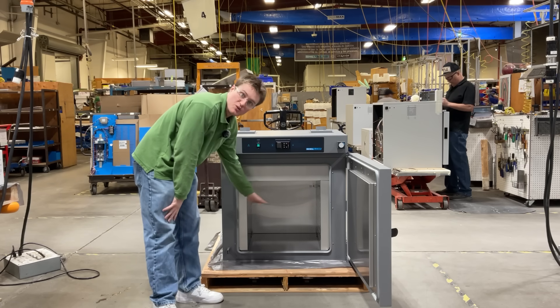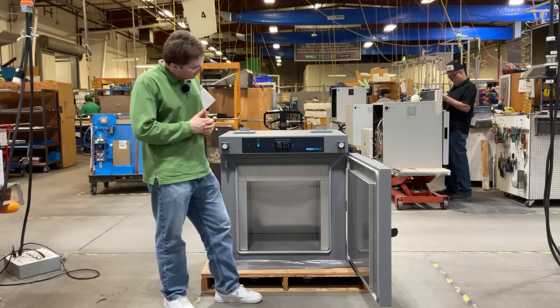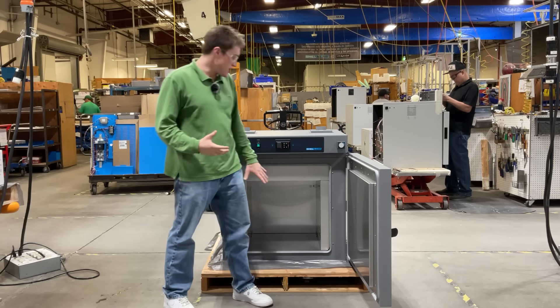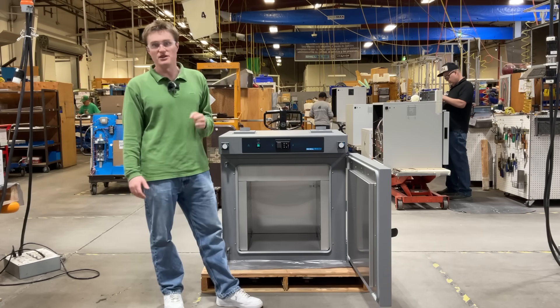Each unit is included with two shelves to provide ample sample space for your needs. Last but not least, the chamber is constructed out of corrosion-resistant materials to help increase the longevity of your unit.